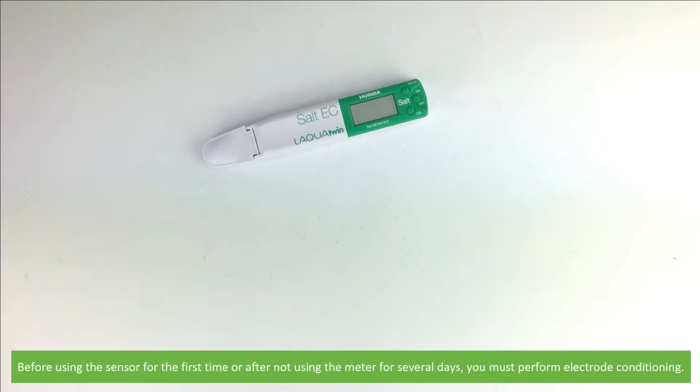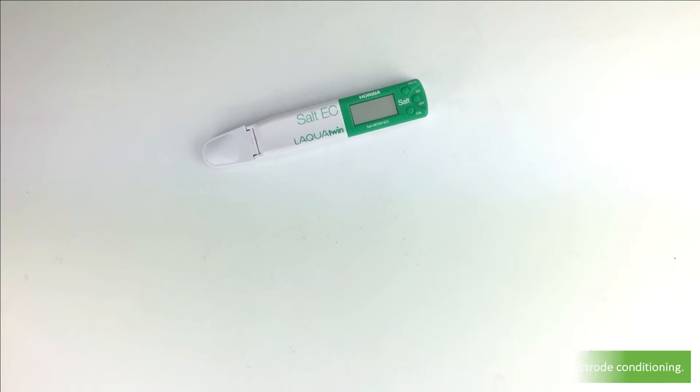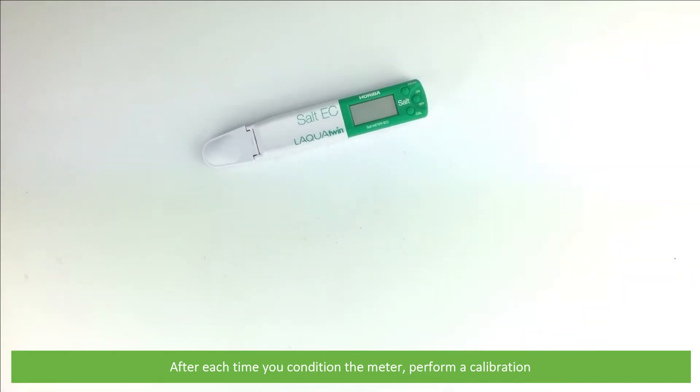Before using the sensor for the first time, or after not using the meter for several days, you must perform electrode conditioning. And after each time you condition the meter, you must perform a calibration.